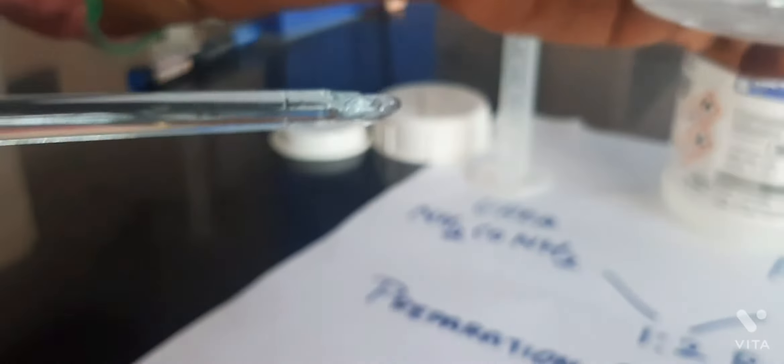Now it should be dissolved thoroughly. We have to stir it constantly until the solution becomes transparent. Before it is thoroughly mixed, we should not add the sulfuric acid. Ensure that the substance is completely dissolved.